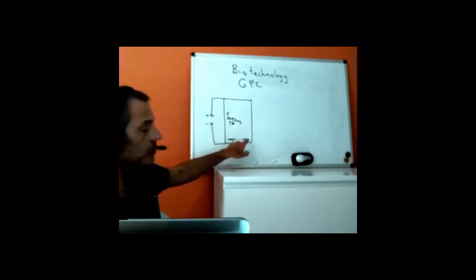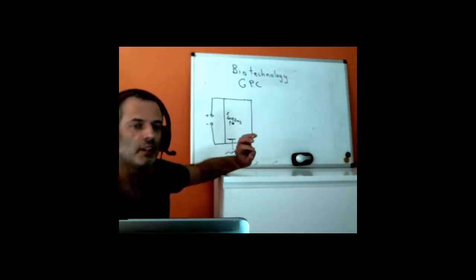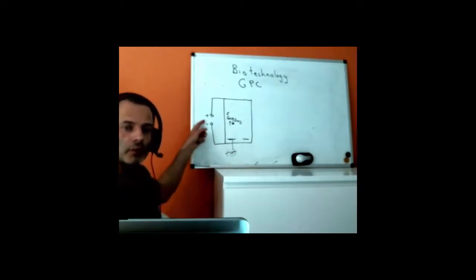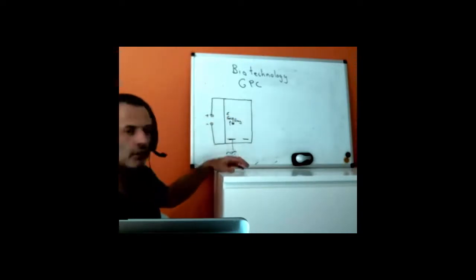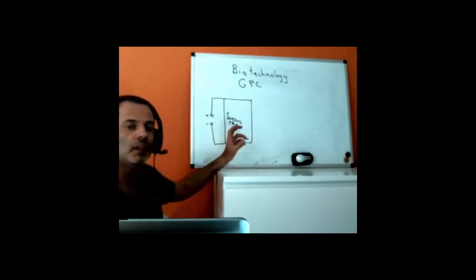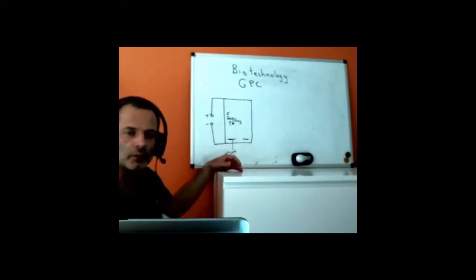You'll notice I've drawn two bars there. That's because there's a problem with this technique. There's a problem with all techniques. This one is just the same. The problem here is we apply a voltage here. We've got a reasonably high current, so we get a warming effect. We will heat up this material, and that will change the viscosity of the water, and that will mean that the DNA will move faster and faster as time goes on. So it's therefore very difficult to standardize the temperature and the conditions that we have.